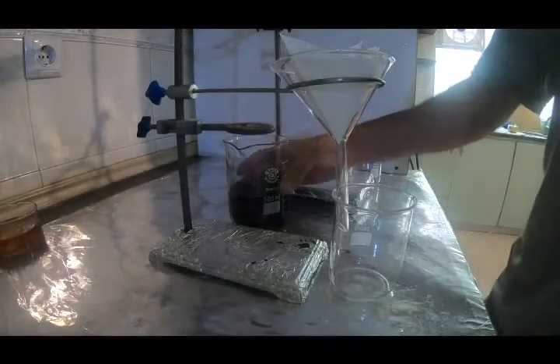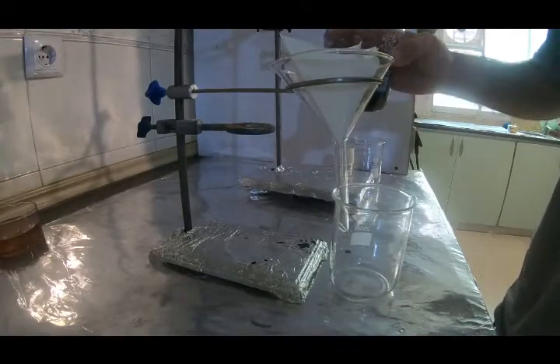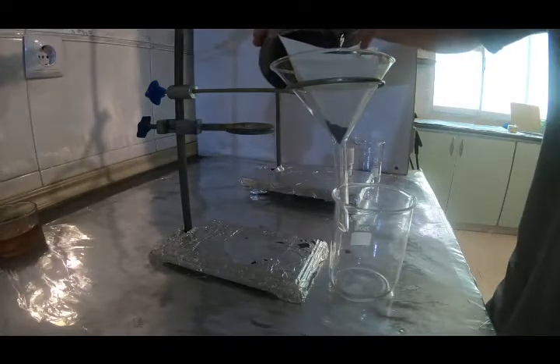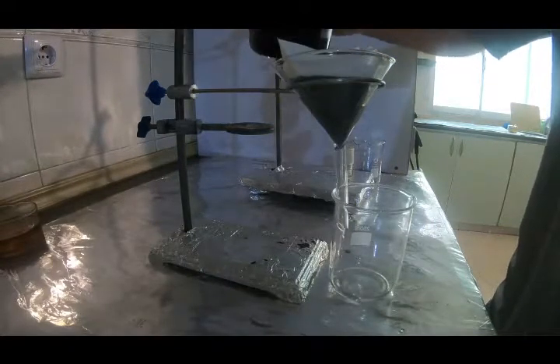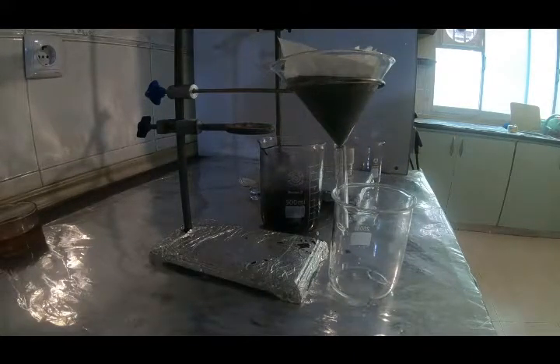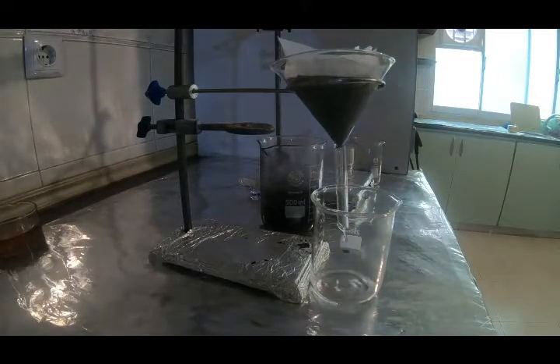Okay, it has been a few hours since we added the charcoal to the nitric acid solution, so now we can just go ahead and filter it. There is nothing really to see, it is just a simple filtration. So I may go ahead and just pause the video. After it's done, we will return.